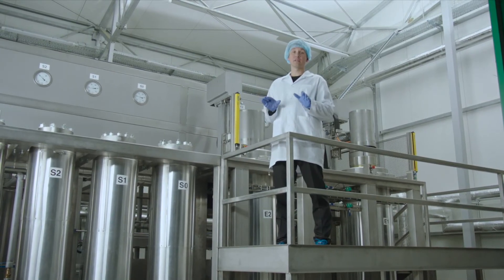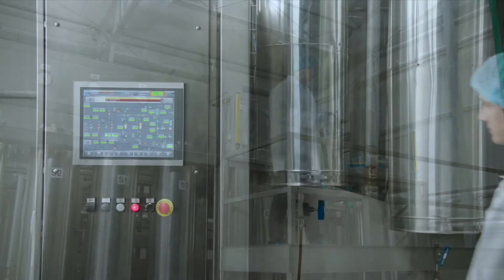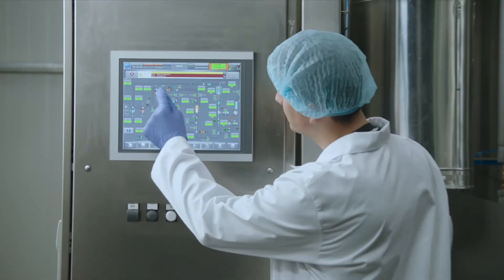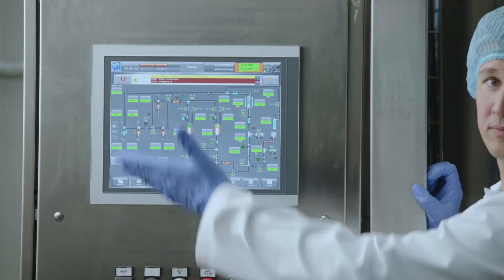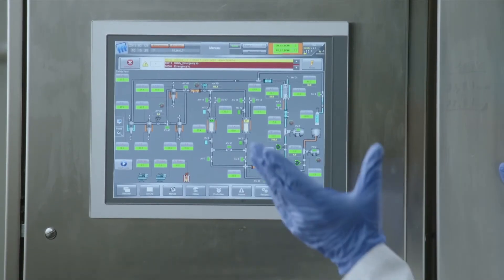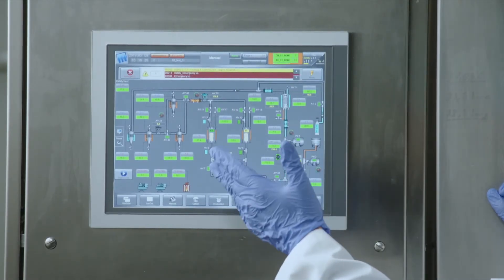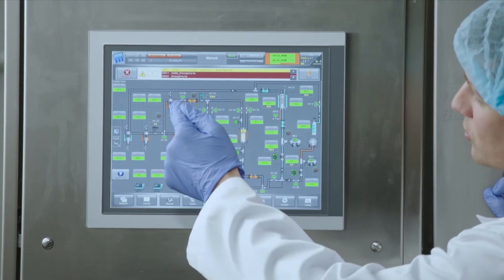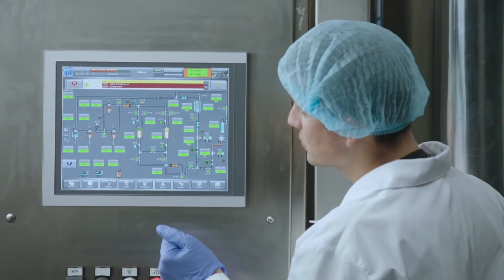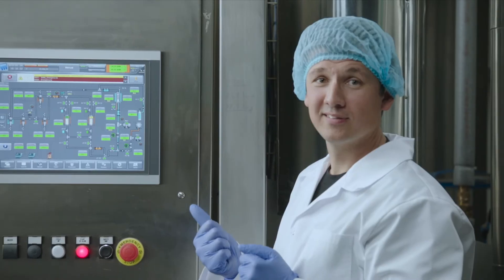This extraction in here is very unique — it's fully automated and can be controlled from your iPad. I'm going to show you on the LCD screen how it works. This is the screen from where we operate the whole machine. All the different boxes you see here are pumps and different equipment that we can choose, and we can change the parameters. The CO2 goes into one of these two big tanks — the extraction units — and after some time it goes into the final chamber here where we evaporate the CO2 and get the oil. This can be connected to an iPad and you can actually do this from home if you want.